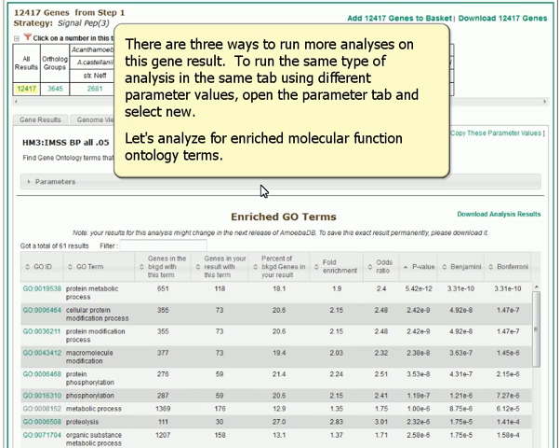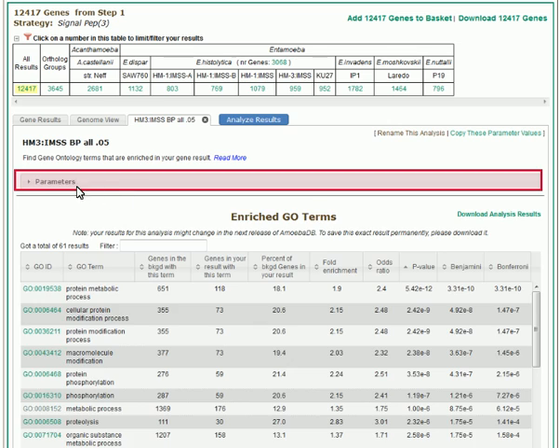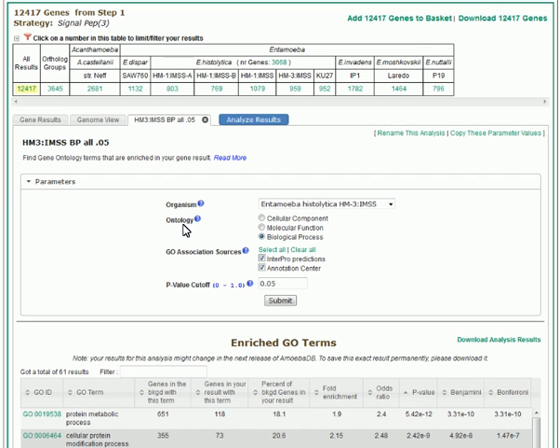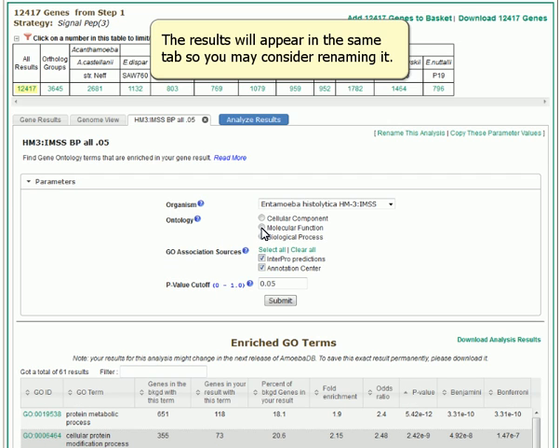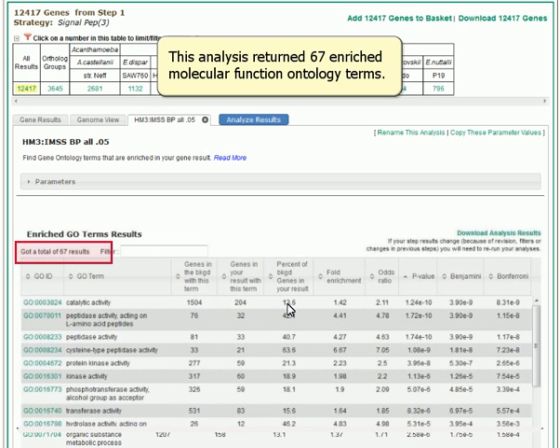There are three ways to run more analyses on this gene result. To run the same type of analysis on the same tab using different parameter values, open the parameter tab and select New. Let's analyze for enriched molecular function ontology terms. The results will appear in the same tab, so you may consider renaming it. This analysis returned 67 enriched molecular function ontology terms.